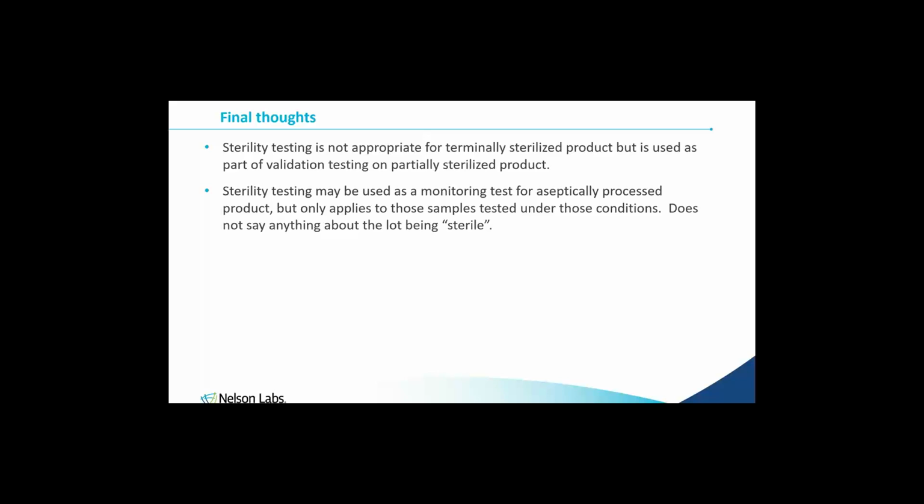So sterility testing may be used for monitoring. Again, it's part of USP if you're doing aseptic or pharmaceuticals, but as it says, it only applies to those samples tested under the specific conditions of the test. It does not say anything about the lot actually being sterile.